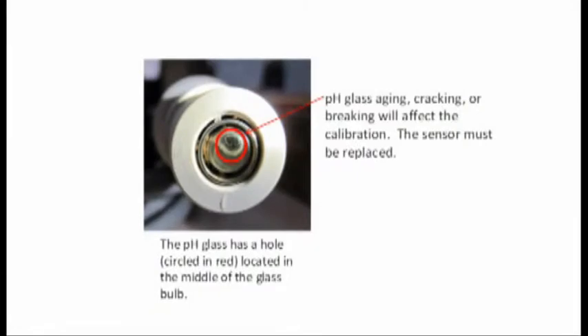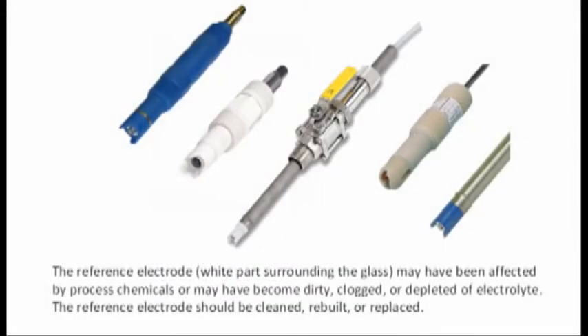Reason 2: the pH-sensitive glass has aged. Reason 3: the pH-sensitive glass is cracked or broken. If the pH-sensitive glass has aged, cracked, or is broken, the sensor should be replaced. Reason 4: the reference electrode has been affected by process chemicals. Reason 5: the reference electrode is dirty, clogged, or depleted of electrolyte. If the reference electrode has been affected, the sensor should be replaced.